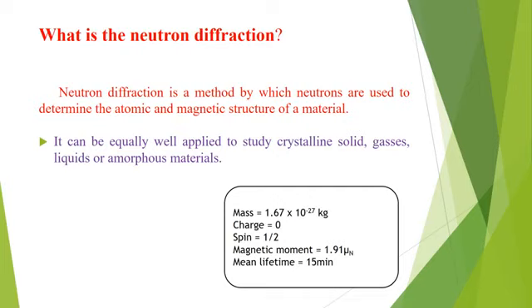In this technique we are going to study neutron diffraction. In the previous lectures, we studied that we were using X-rays as a source. But in this lecture, we will study neutron scattering, or the neutron diffraction pattern, where we take a neutron as a source instead of X-rays.